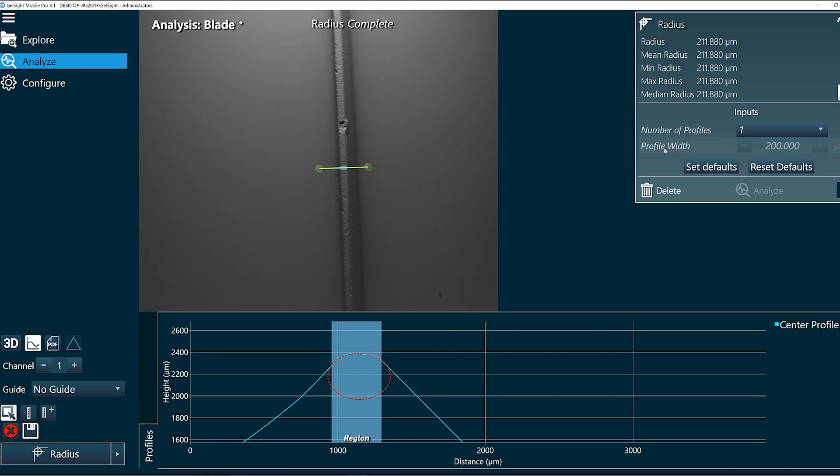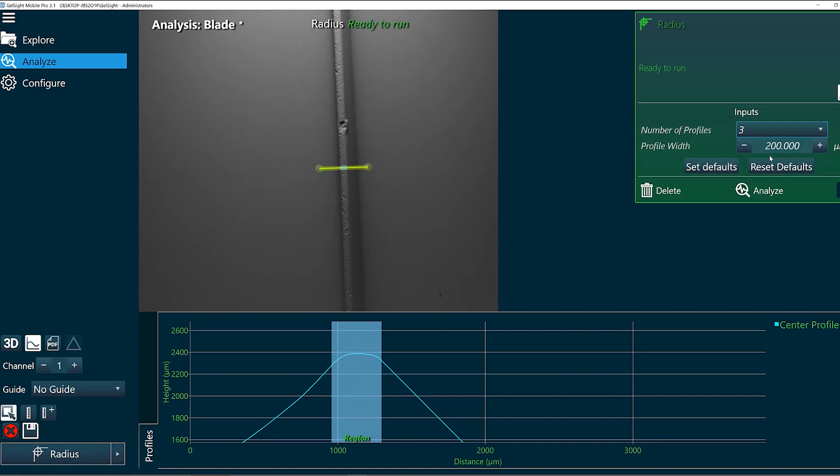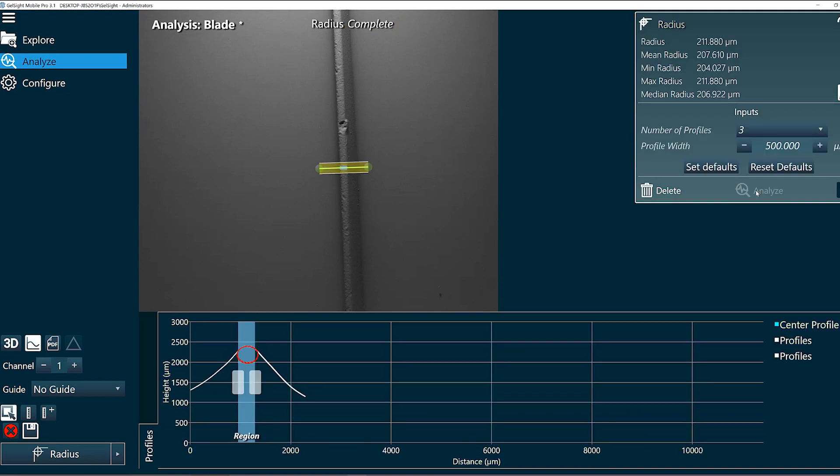So one advantage of Gelsite is that it's an area scan camera so we can measure multiple profiles at the same time. Maybe I want to measure three profiles across a width of 500 microns. I'll enter three profiles and 500 and click analyze.